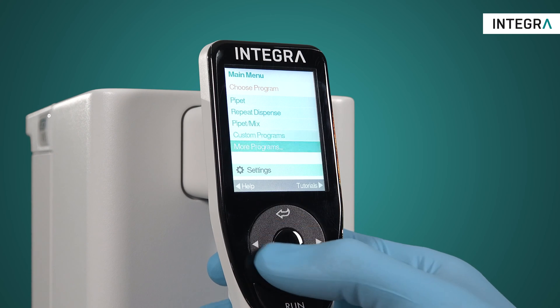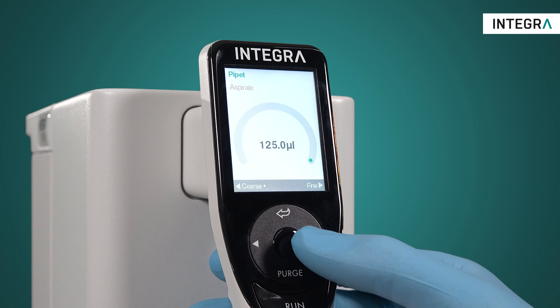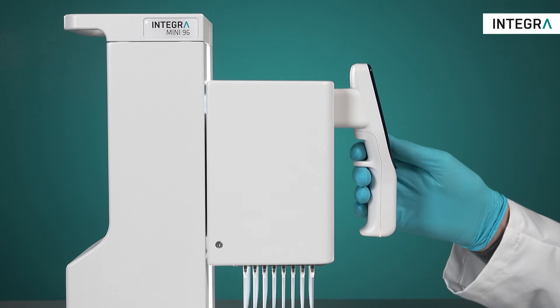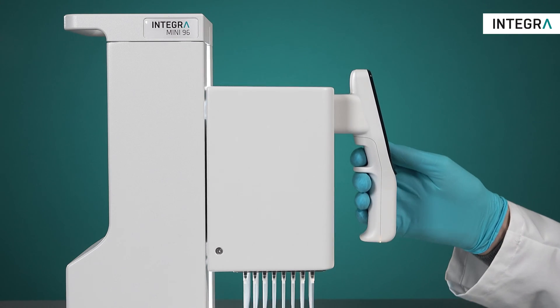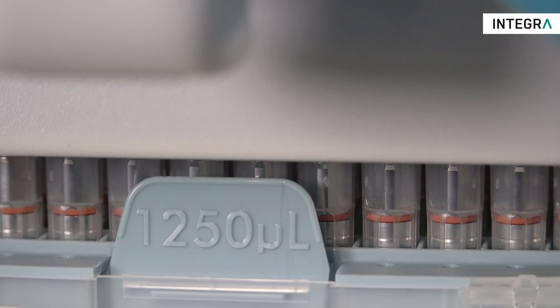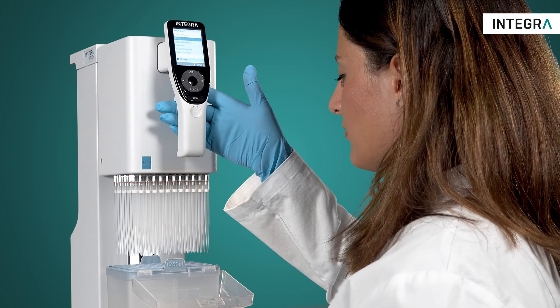In terms of ease of use, the MINI 96 is as simple to use as a single channel electronic pipette. A servo motor assists all movements, resulting in effortless pipetting. The MINI 96 is compatible with grip tips, which are guaranteed to never leak or fall off in the middle of your pipetting routine.